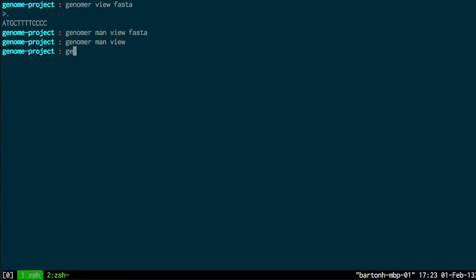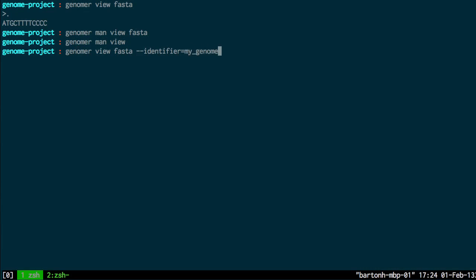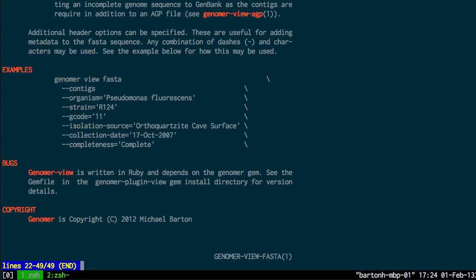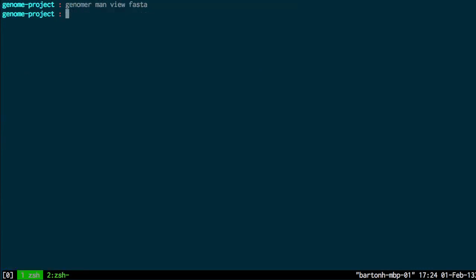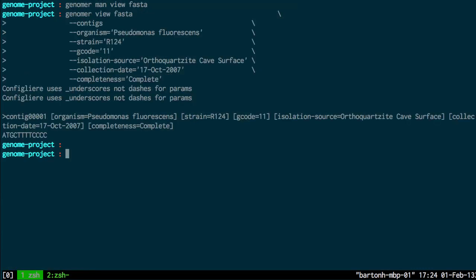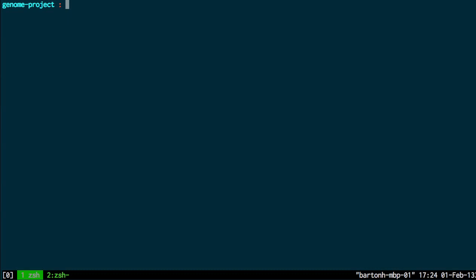So for example Genoma view FASTA identifier equals my genome. That just adds the FASTA header. And if I use the more complex example from the man page here, you can see it's the FASTA and you have all of this FASTA metadata added to the top. So that's an example of using that.